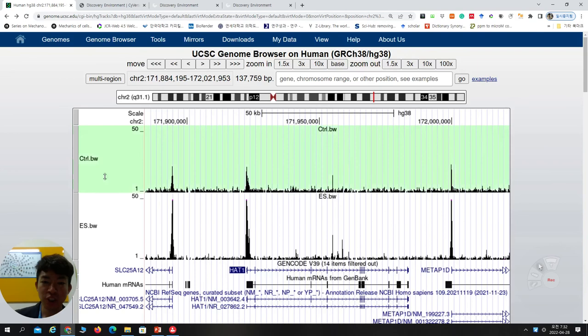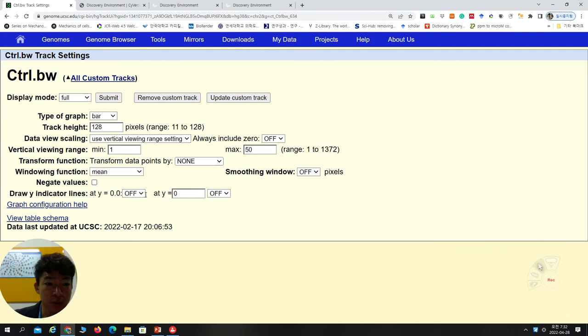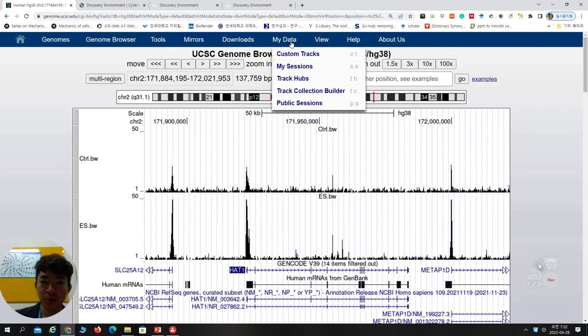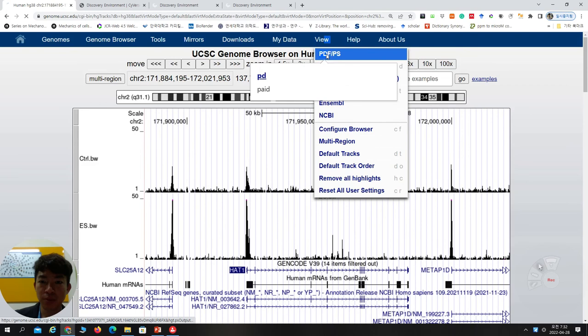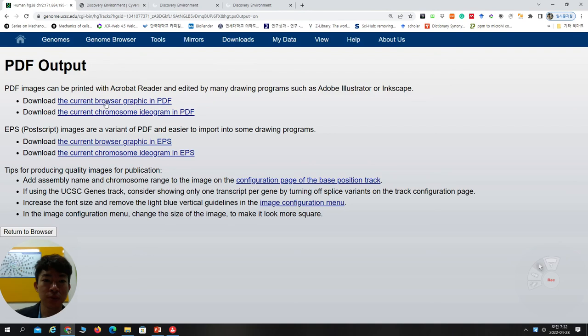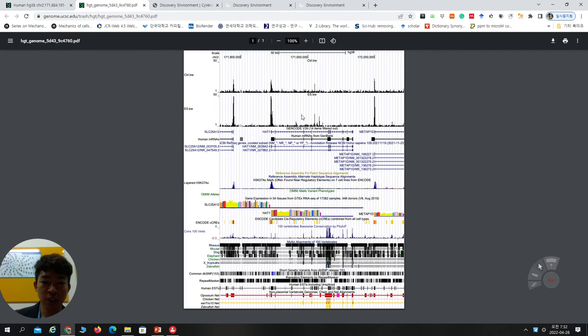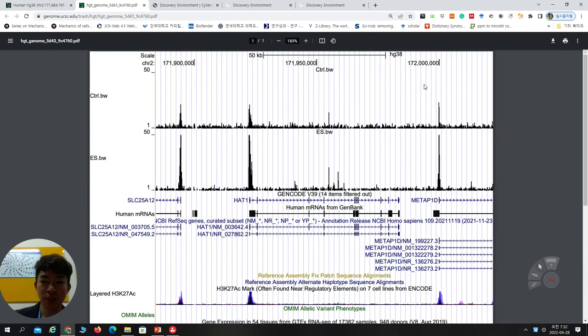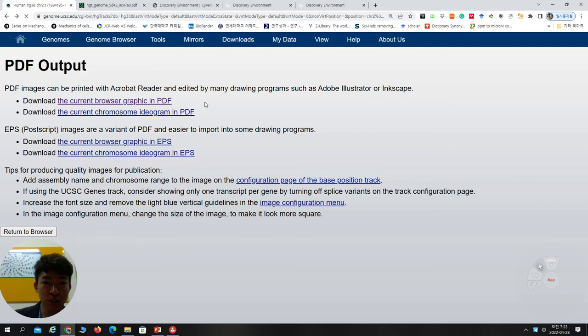So sometimes this can be used this way. When you've almost finished collecting the data, go to 'My Data,' 'View,' and 'PDF.' You can collect the PDF, see all the data together, then copy and paste this side and change it. If you want to remove the Y-axis arrow, I saw somewhere how to change this — go to 'View,' then 'Configure Browser.' You can change the pixel, character, label size, text, and font style. Most of the time, use Times New Roman font, then remove everything.